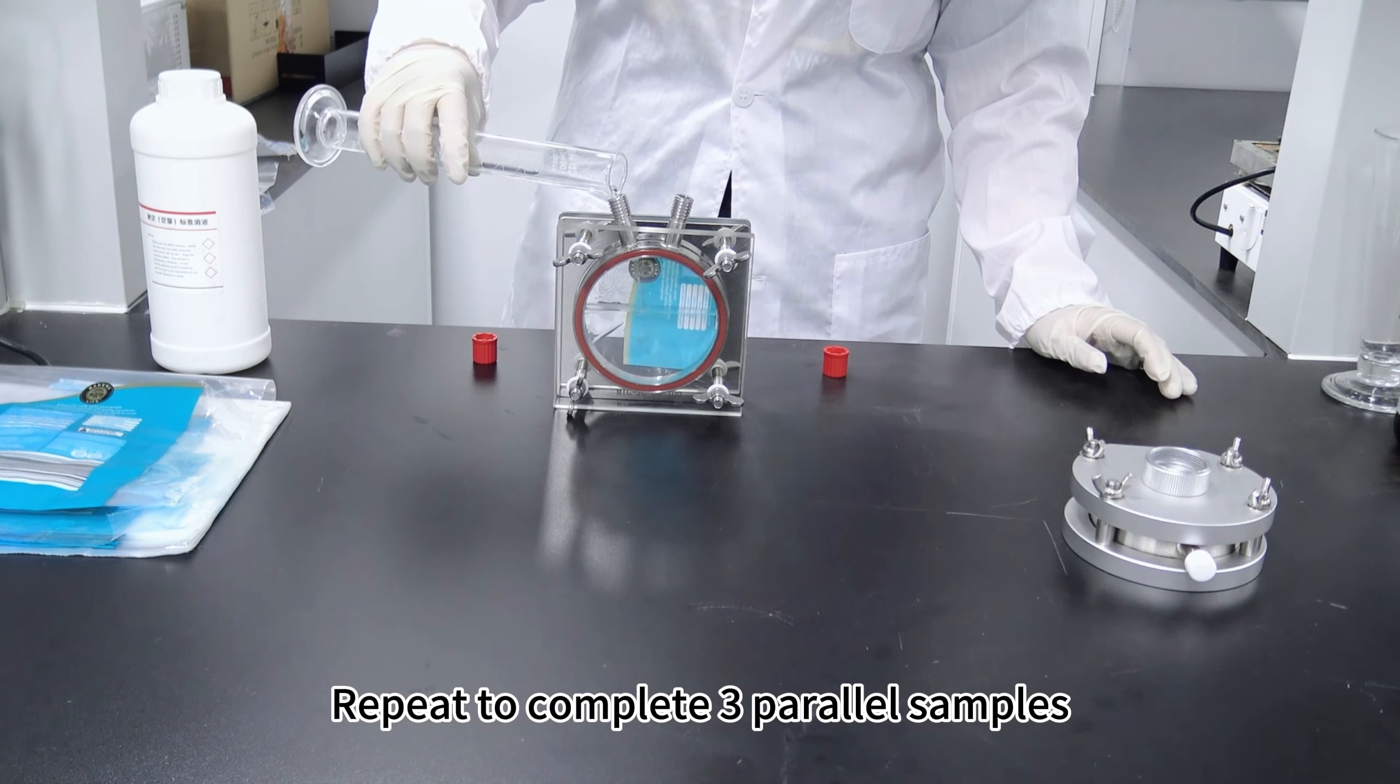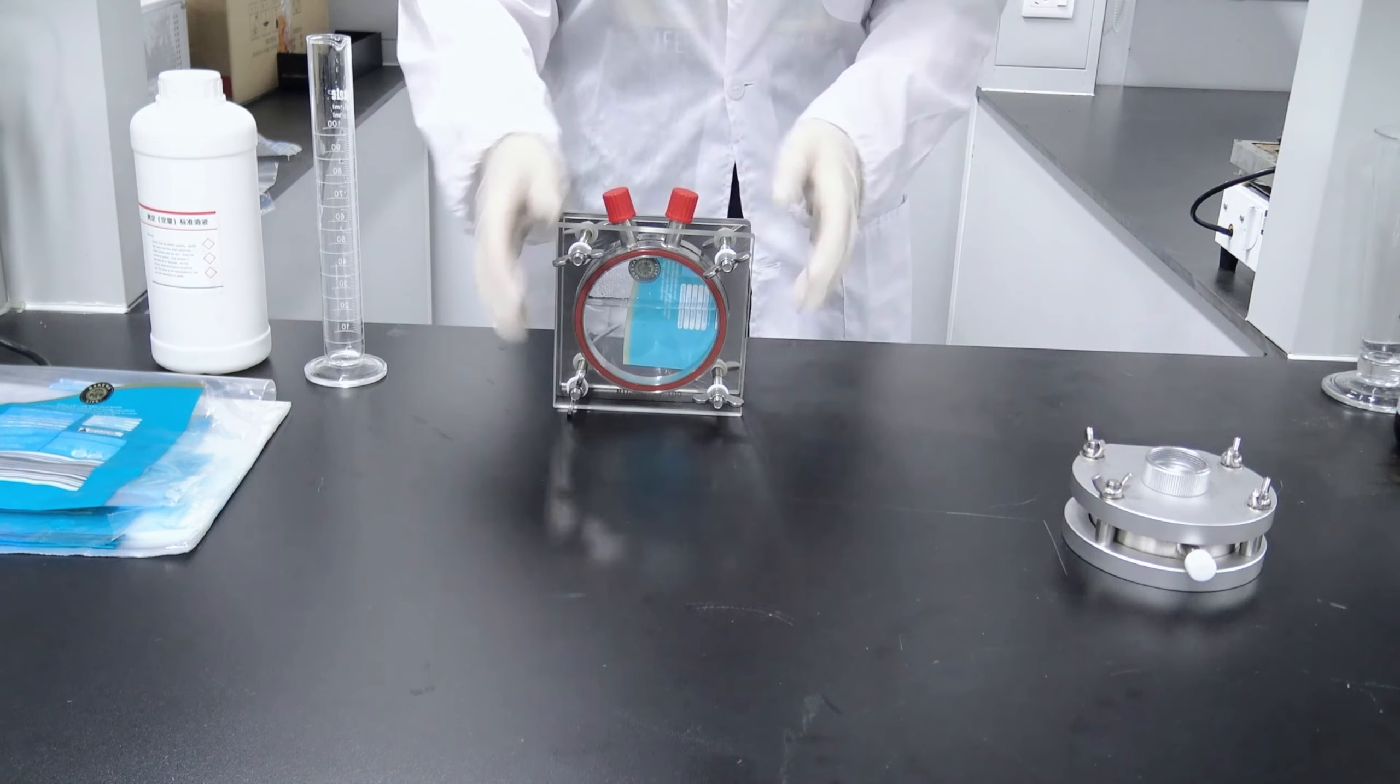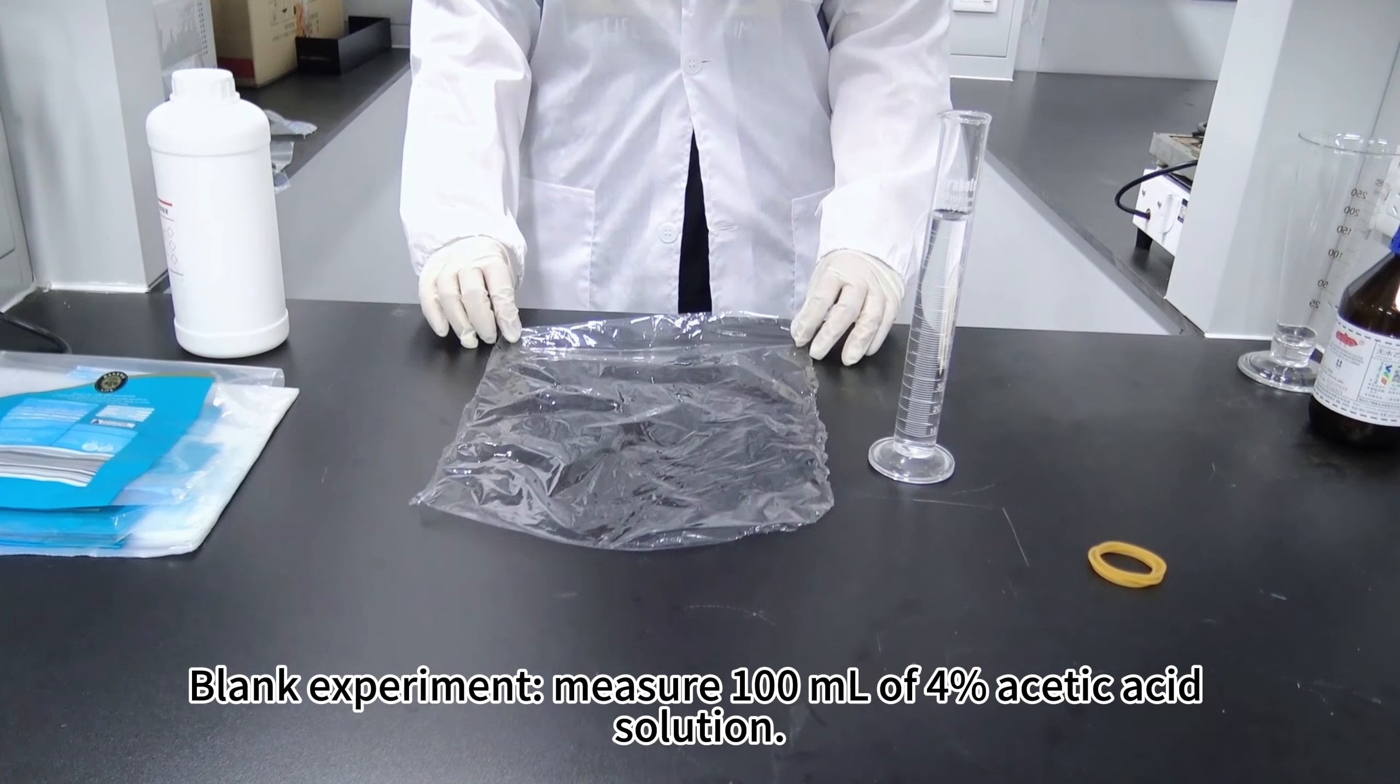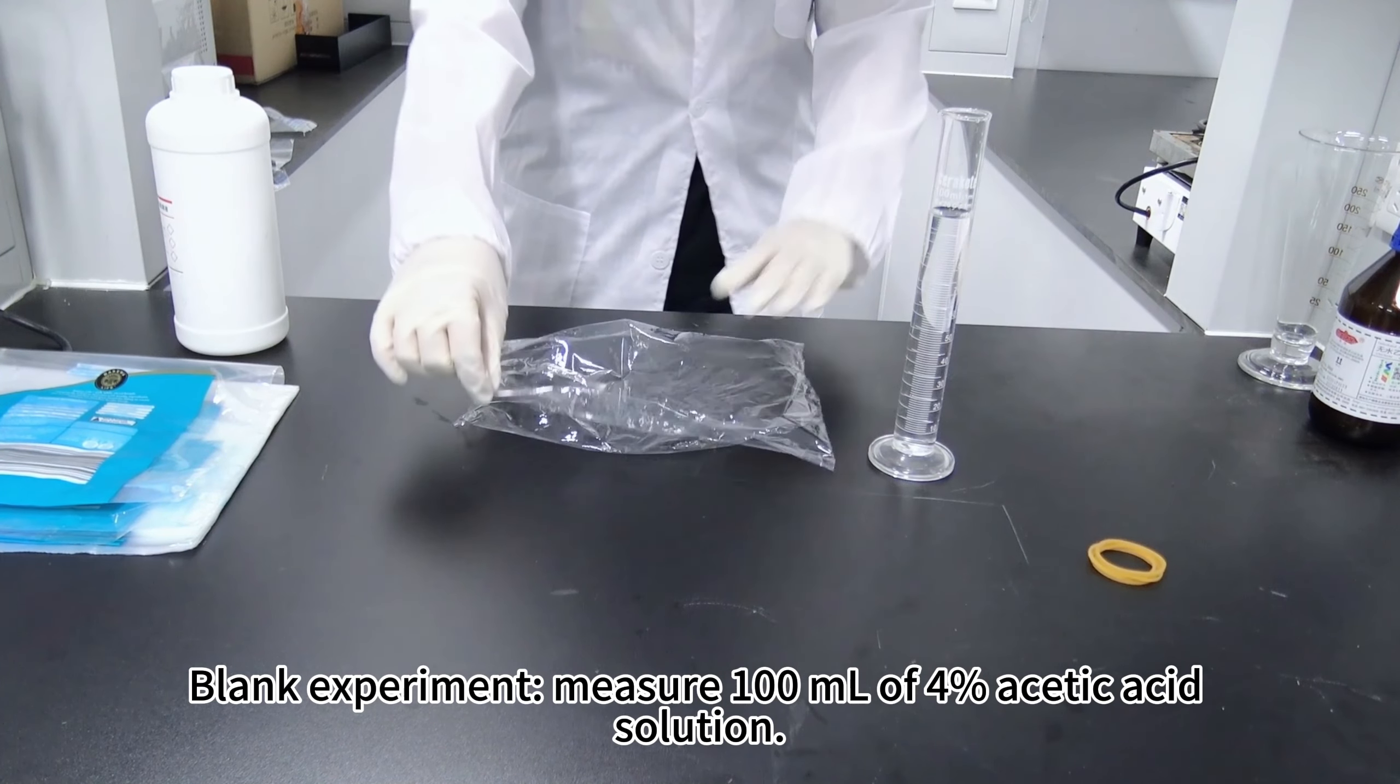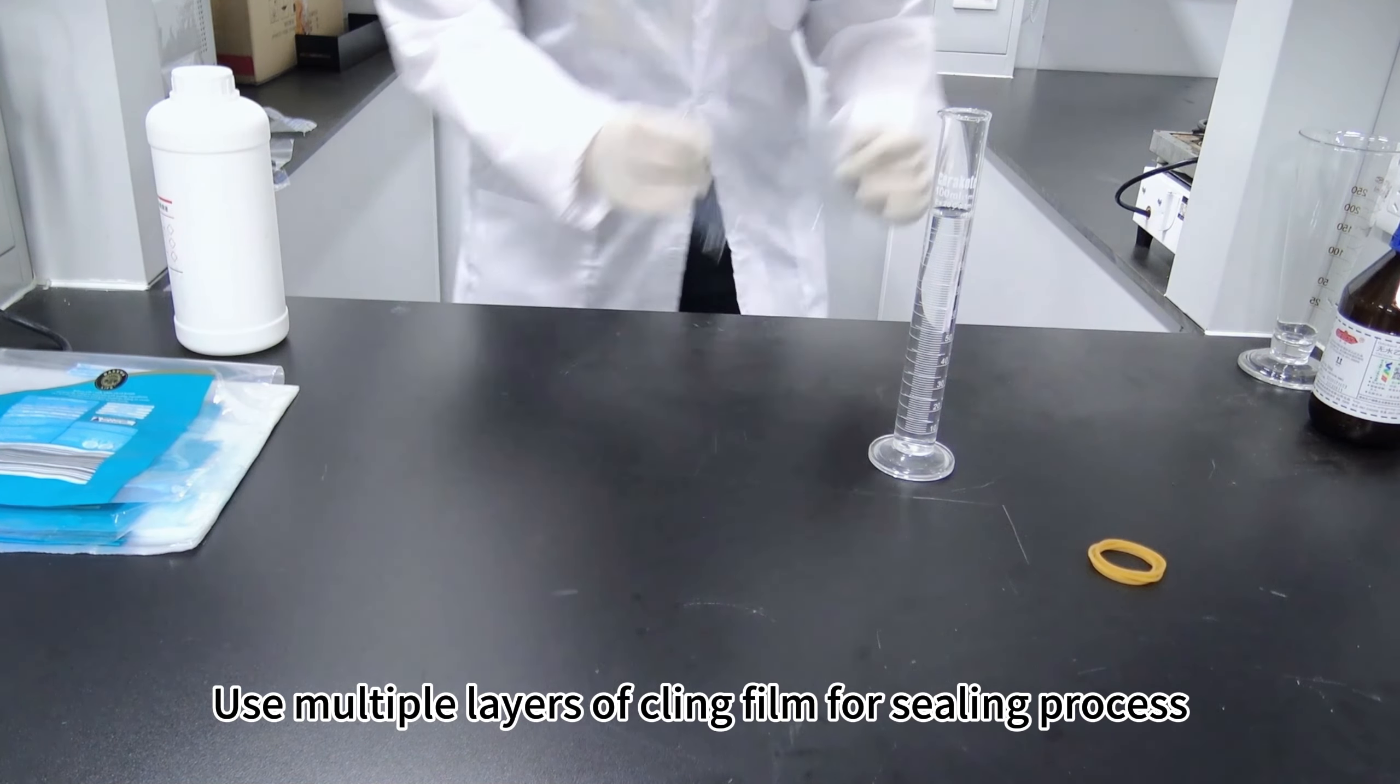Repeat to complete three parallel samples. Blank experiment: measure 100 milliliters of 4% acetic acid solution. Use multiple layers of cling film for sealing process.